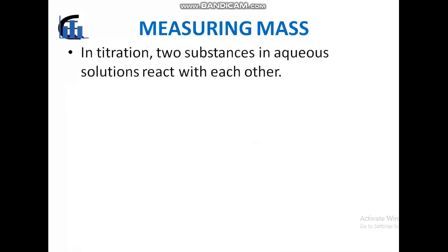In titration, two substances in aqueous solutions react with each other, for example, acid and base.